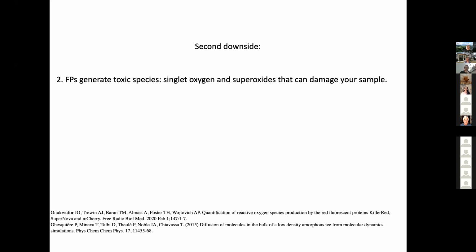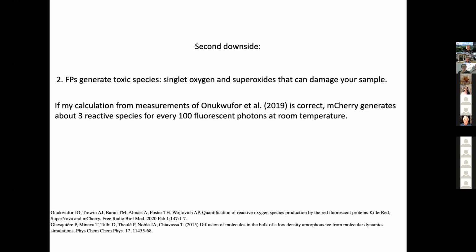So the second downside is that fluorescent proteins, when they're illuminated, generate toxic species, singlet oxygen and superoxides that can damage your sample. If my calculation for measurements based on this paper I referred to is correct, mCherry generates about 3 reactive species for every 100 fluorescent photons.